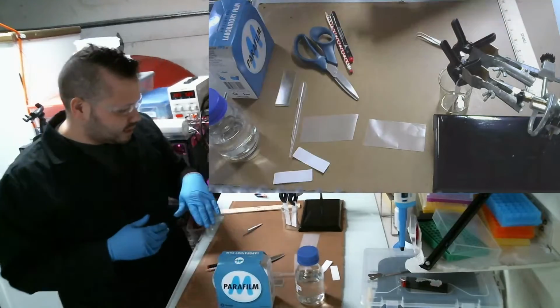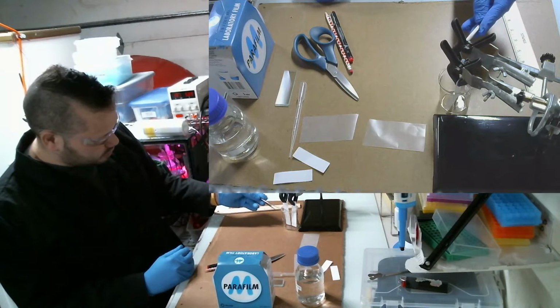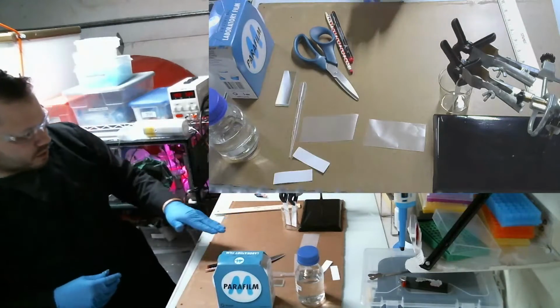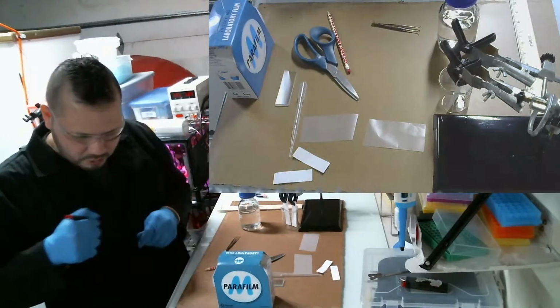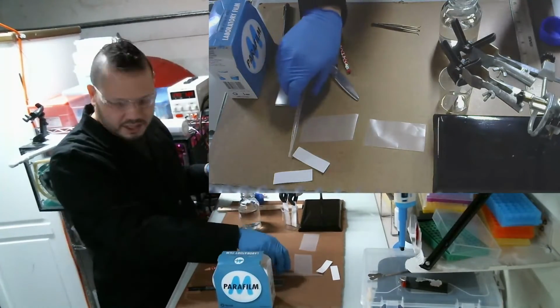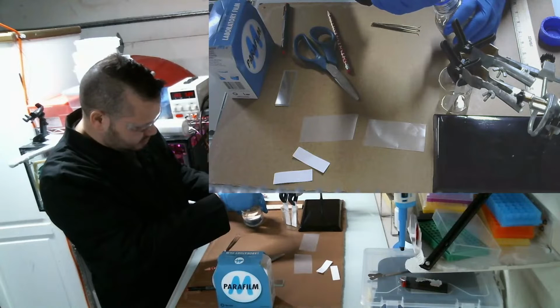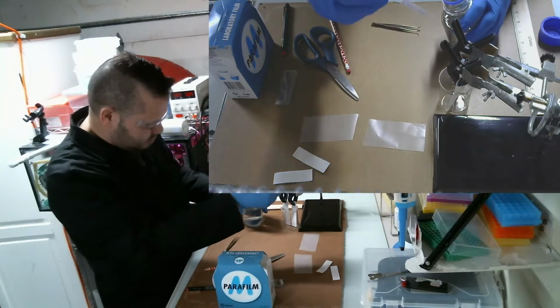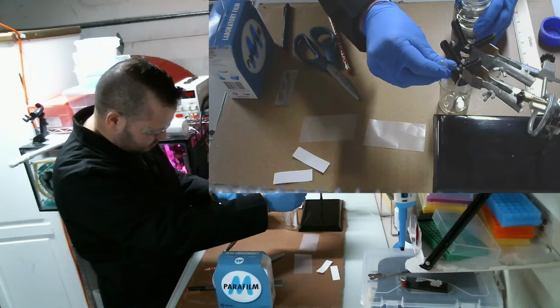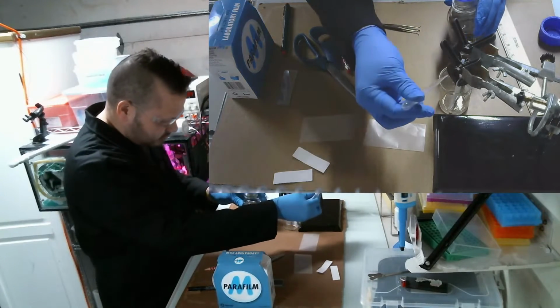And the idea is I want to get the solution to soak all the way up to the line, and then once it hits the line, I'm going to take it off and allow it to dry. Now, one thing is to check off the steps that you've done, so you don't do them again. I might have to put one more. It's just barely touching. It's soaking, but it's barely touching.